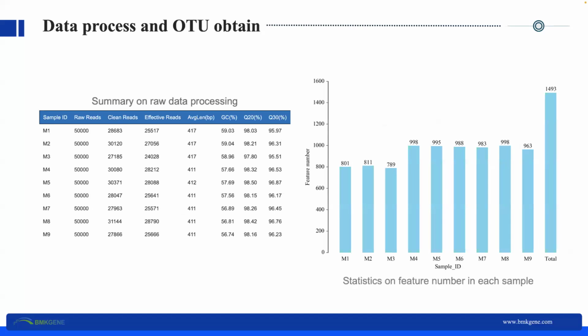Data processing and OTU clustering. Raw data was processed as described above, and data quality was estimated based on read lengths and counts of reads at each target. OTU refers to a cluster of sequences used to define a group in population genetic studies. We can apply it to cluster reads with similarity above 97%, generating OTUs.